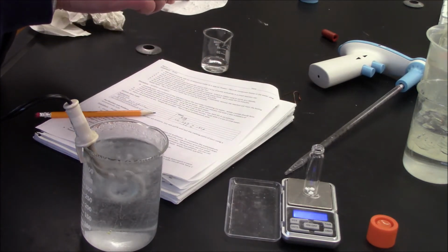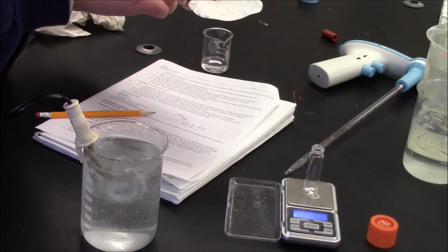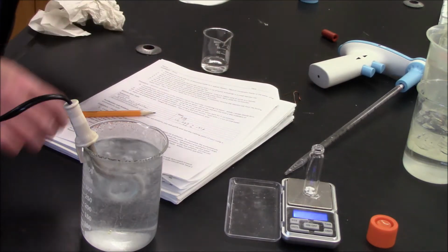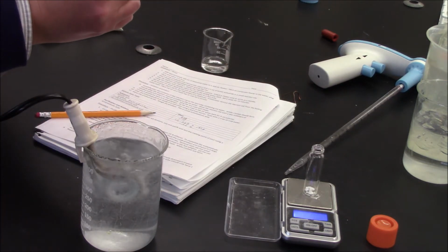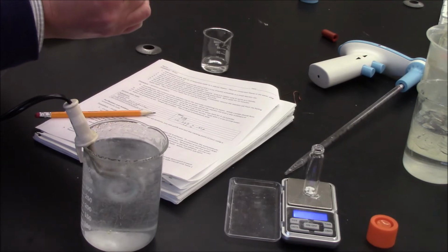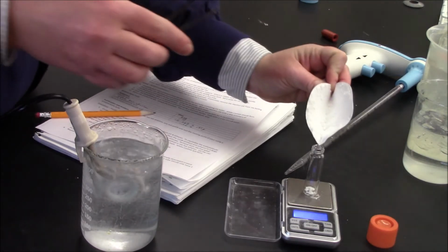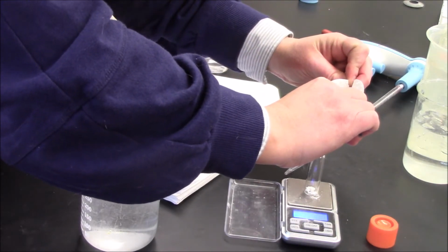I start by adding the large crystals, and they're not really adding up to any measurable mass on my balance. So eventually what I have to do is try to create a cone out of my filter paper and try to add as much of my product as I can to my large reaction vial. This process is going to take a minute or two.